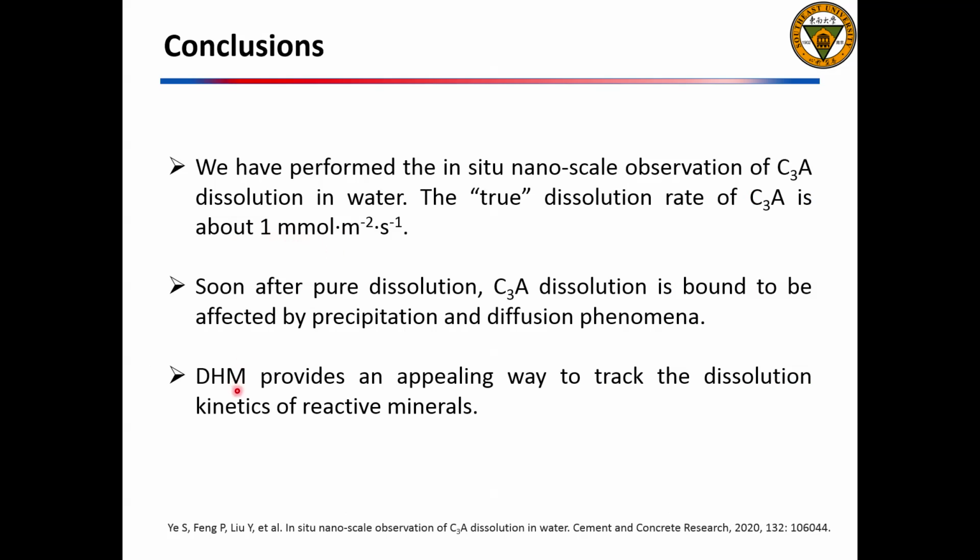And DHM provides an appealing way to study the dissolution kinetics of reactive minerals.